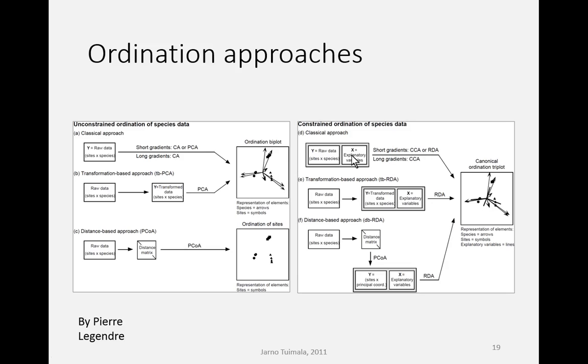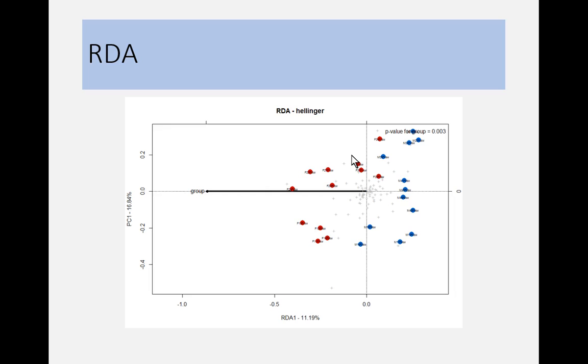I have another question. Yeah. Is the RDA the sum of the different variables? When you have the percentage, for instance, of it? Yeah, you mean these percentages here? I didn't want to go into that, but it's a part of the explained variance, basically. So the more variables we have, the more we can explain. You typically only plot 2 axes in the plot. Well, you can put there 3, but it's harder to read because you have to rotate it.